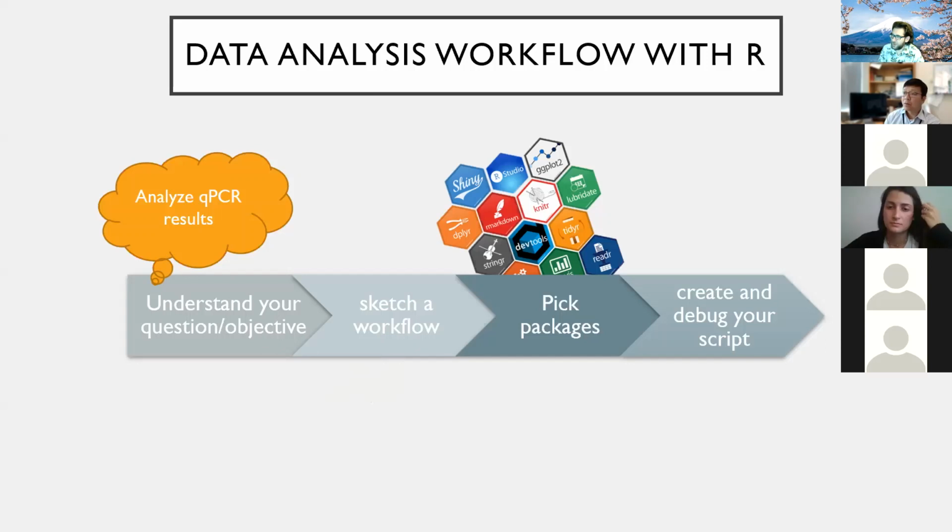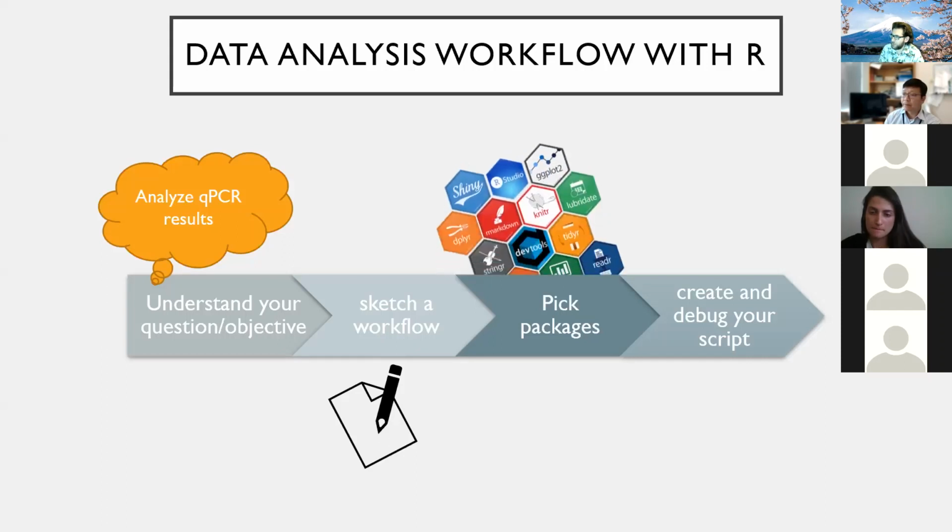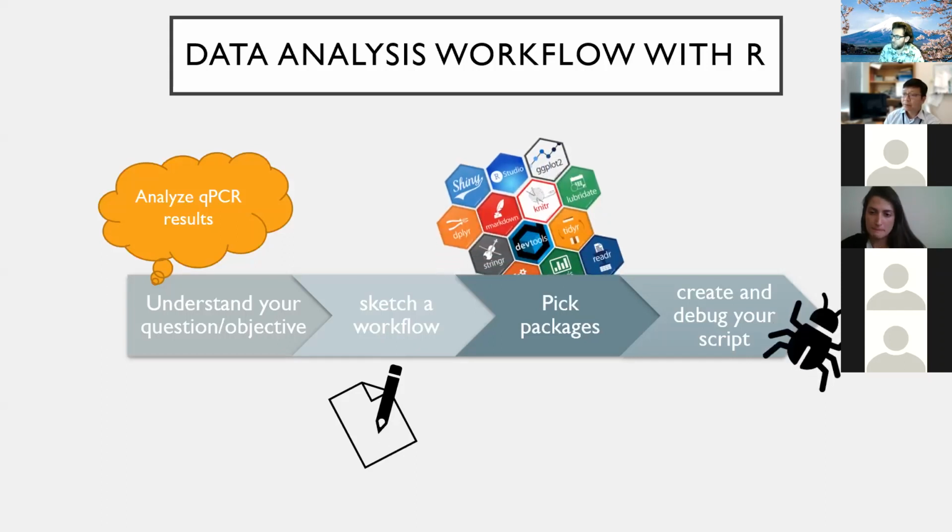So the first thing is to understand what are the objectives of your analysis. And so in our case, we're going to be trying to analyze qPCR data. The next step is to actually sketch a workflow to understand what are the discrete steps of your analysis. Then pick the correct packages, and finally create your script and debug it.